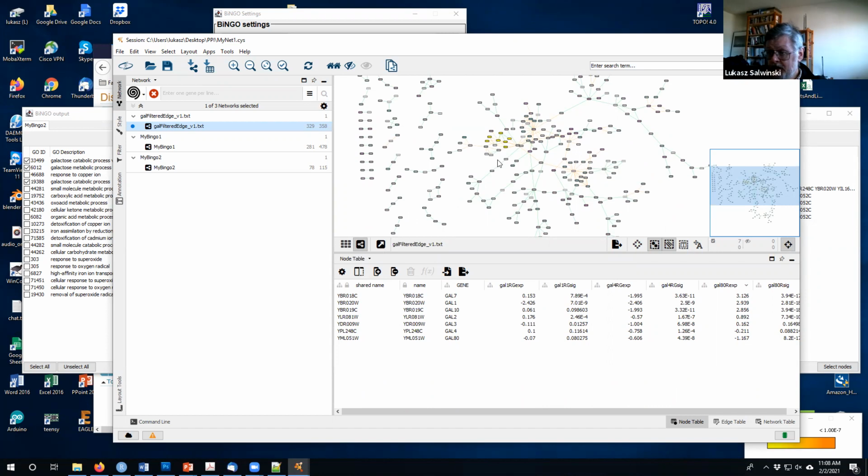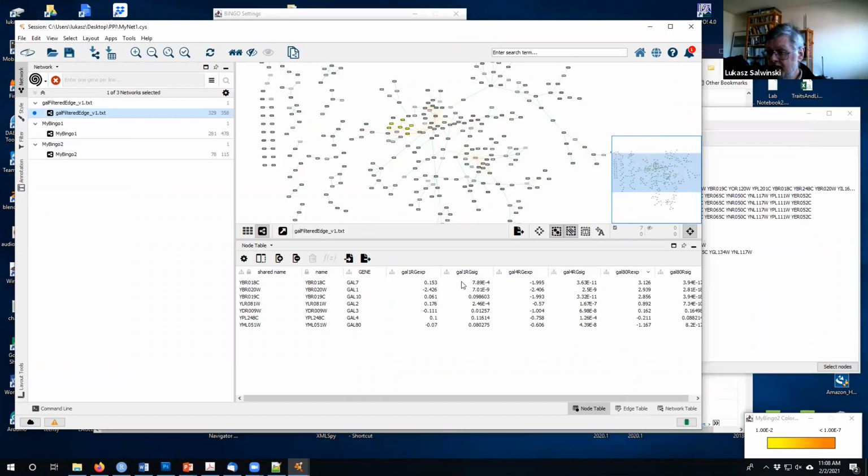far we were working with a God-given 2 or 3 files that came out of nowhere. Essentially, the file where the expression data came from is most likely coming from one particular experiment.